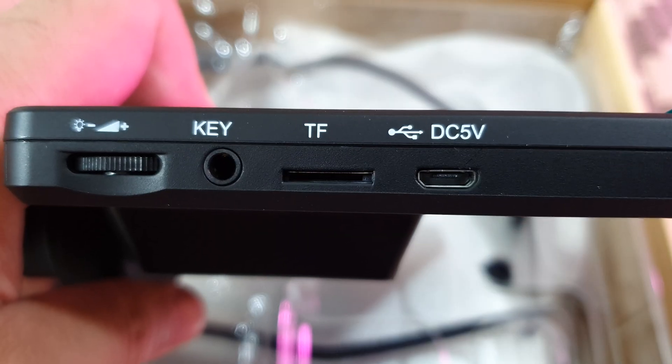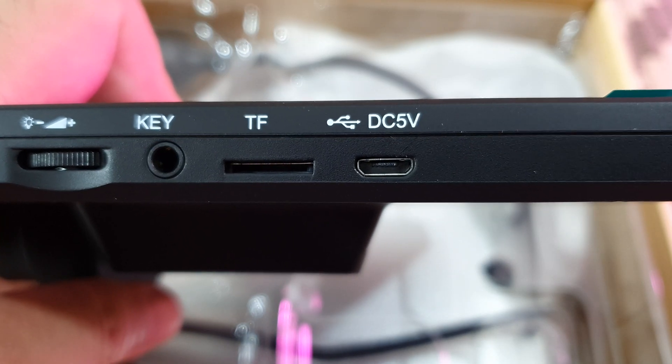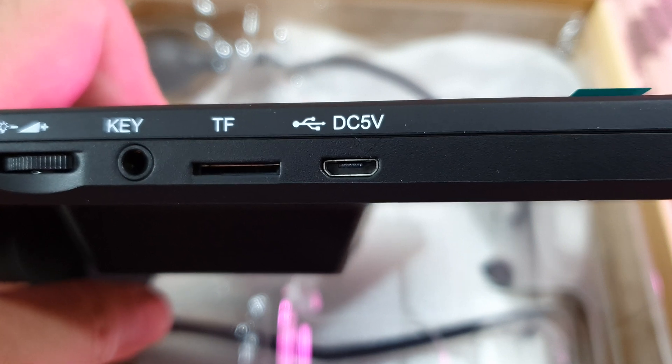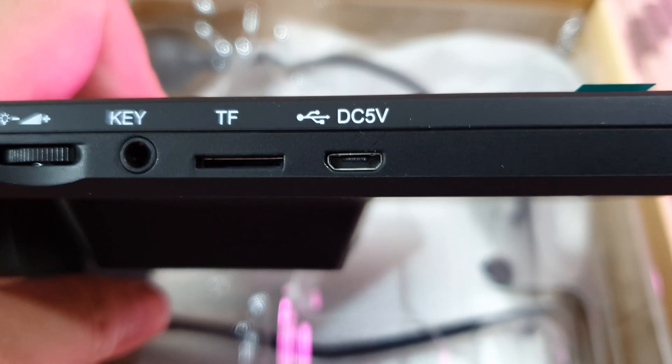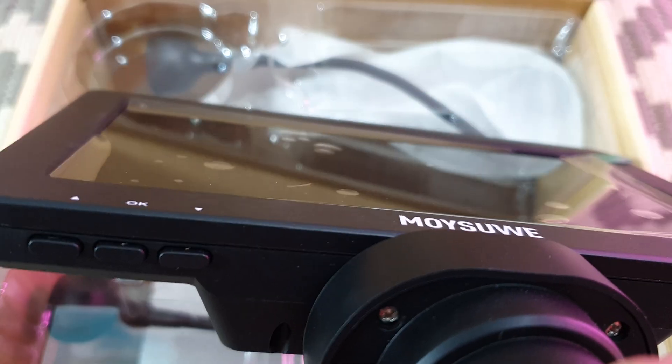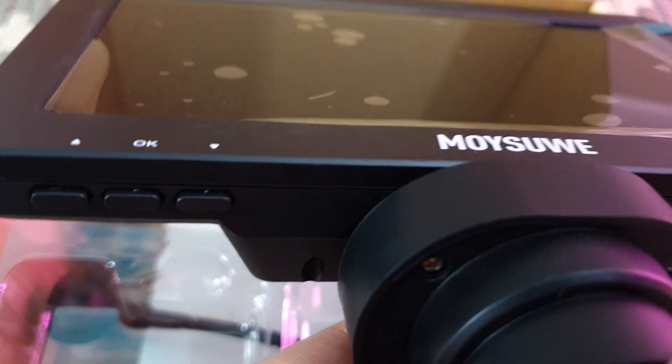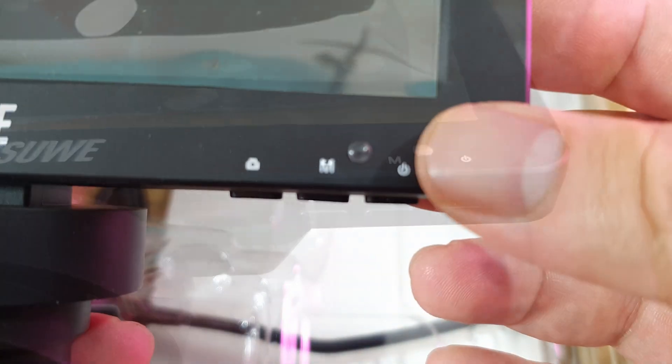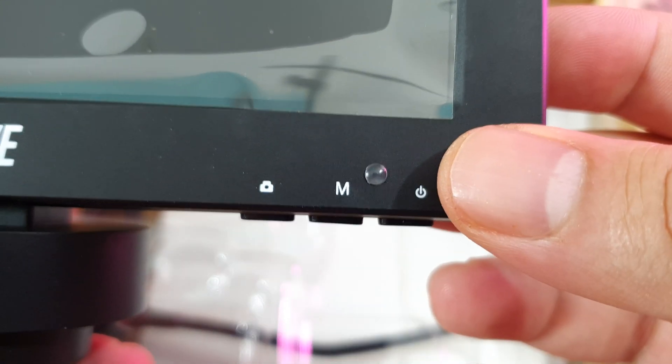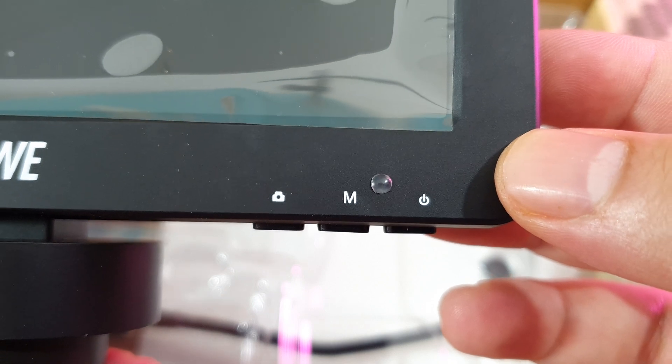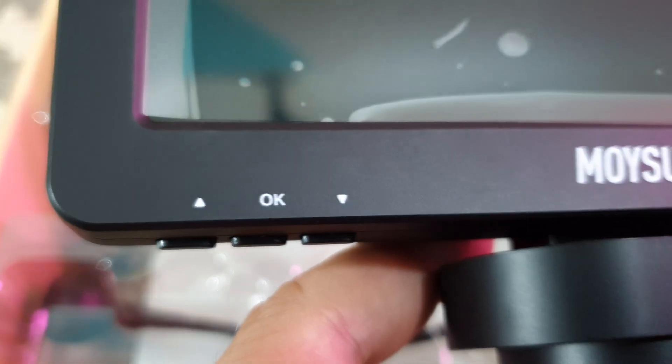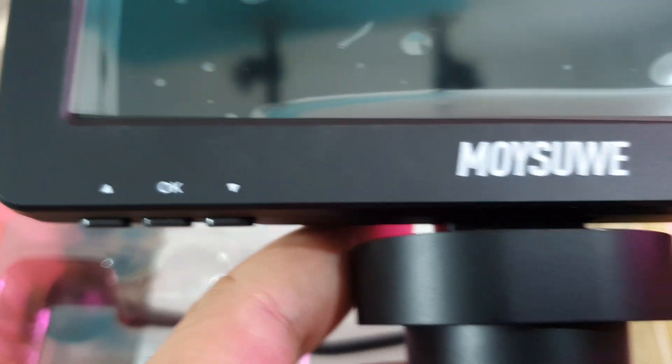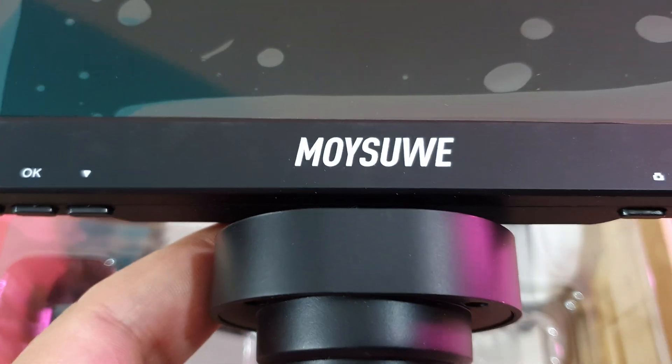Here there are some buttons which let you adjust the brightness, I guess of the LEDs. There's a memory card slot and a few navigation buttons. There's a power button here on the right, and you also have a LED indication there. You can actually use this unit without the remote control unit which they've provided.